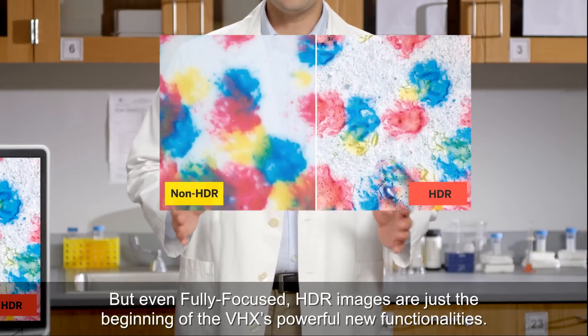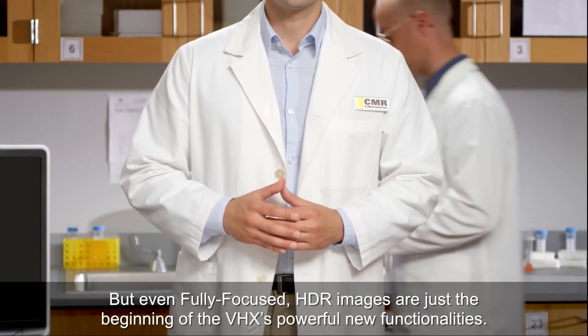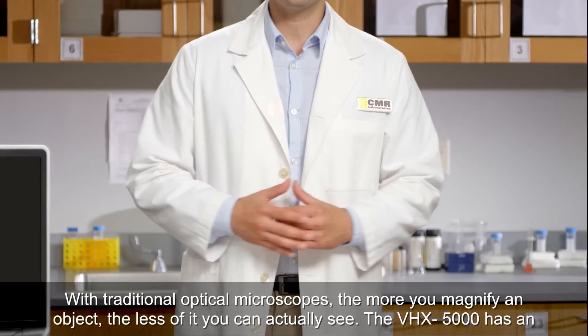But even fully focused HDR images are just the beginning of the VHX's powerful new functionalities. With traditional optical microscopes, the more you magnify an object, the less of it you can actually see.